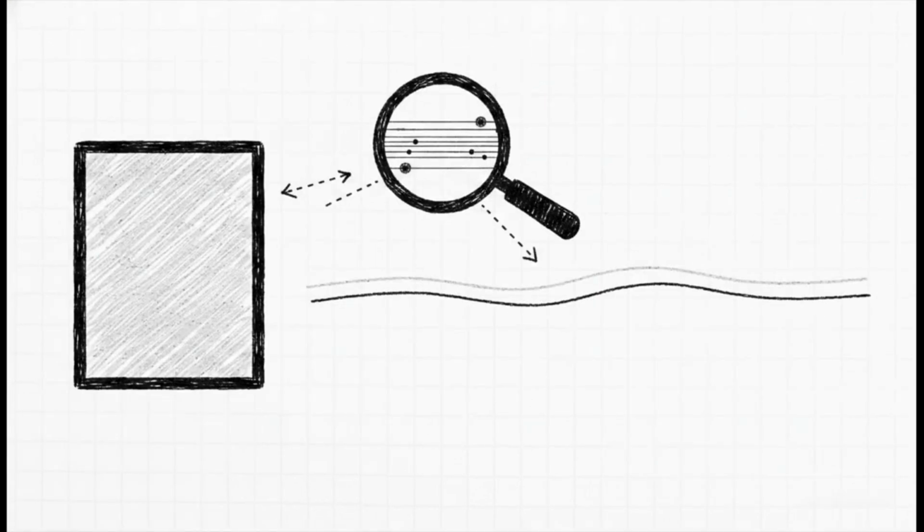So the crucial point is grasping the sheer scale we're dealing with here. Just look at this measurement, 50 nanometer nanowires. To put that into perspective, a single sheet of everyday printer paper is about 100,000 nanometers thick. The FESEM is smoothly and clearly imaging structures that are functionally invisible to us, allowing researchers to measure and shape these incredibly tiny wires with absolute pinpoint precision.